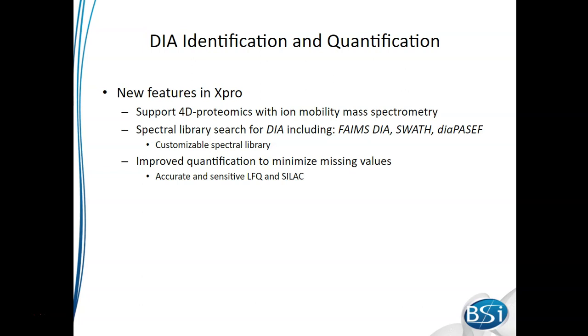In this presentation, I'm going to show some of the new features in PeaksX Pro that help deal with this type of data, and also talk about the improvements that we've made in our quantification in order to limit missing values.